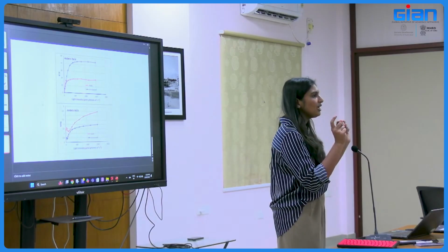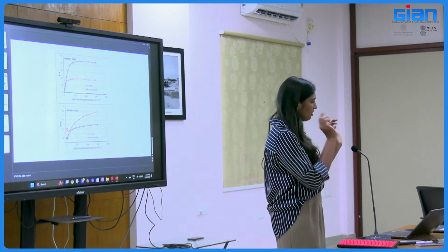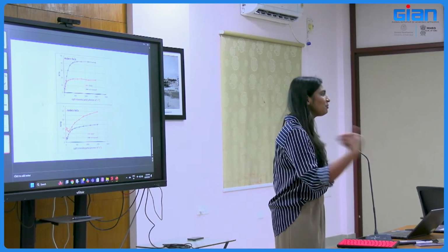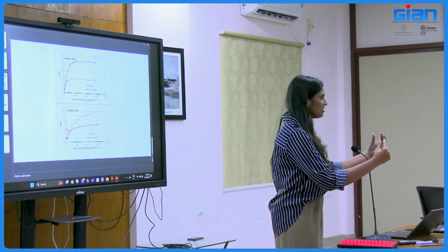So the emitter will be giving something like 830 nanometer. We have a very specific probe. In 830 far red, only PS1 will get excited, not PS2. This is the principle we know. So we give this light and only PS1 will absorb this.